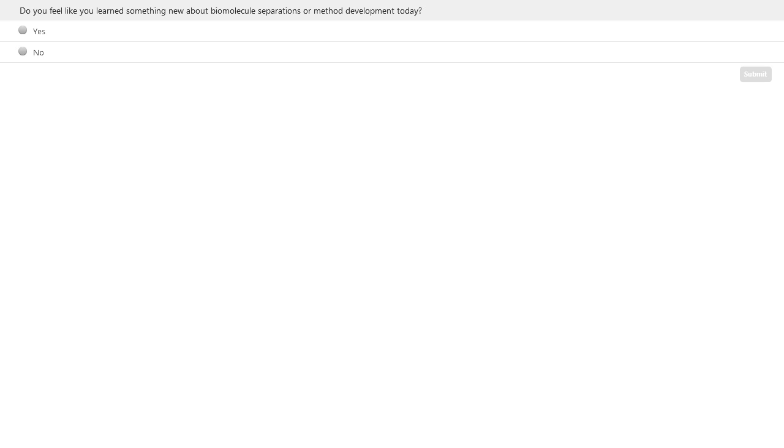It also will ion pair a bit with your sample, so it's acting as an ion pair in the system. It's quite hard to remove it from the column, not as hard as things like HFIP, but you will tend to get a build-up of TFA on the column as well. So it could potentially change the column slightly in the long term as well.